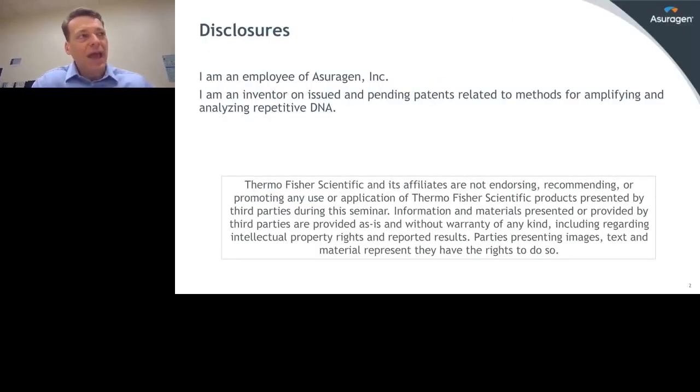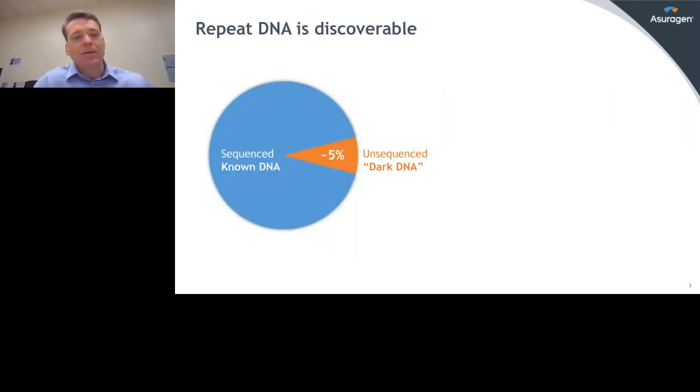But before I get there, I'd like to first talk about some of these really hard to amplify patches of the human genome, this dark DNA, and how it has emerged as important regulatory elements in gene expression, and in many cases as bona fide biomarkers of inherited disease, with implications that range from neurological disorders to reproductive health.